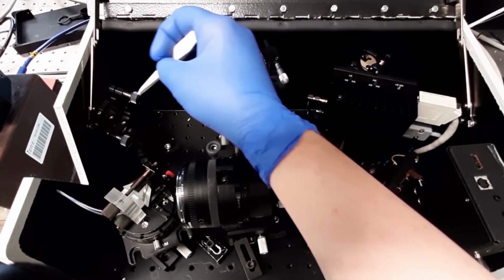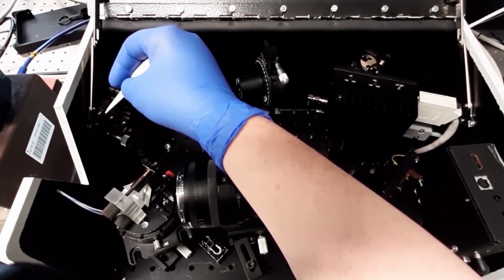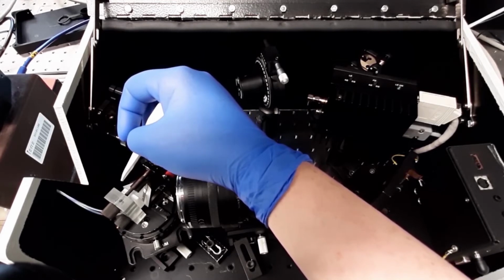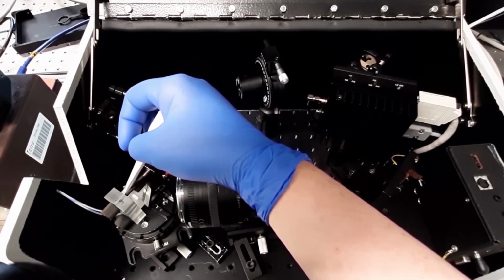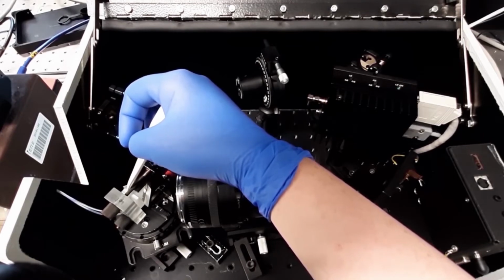Then the beam comes to this mirror and is reflected to the heart of our sensor, to the prism connected with the flow cell, which contains the gold sensor chip.